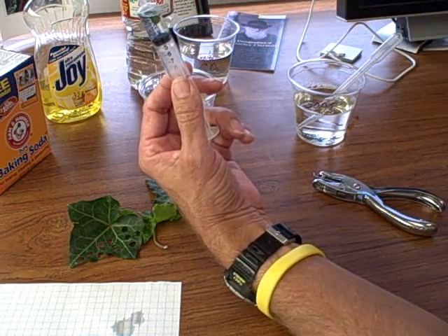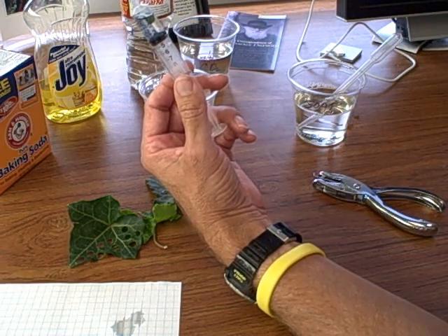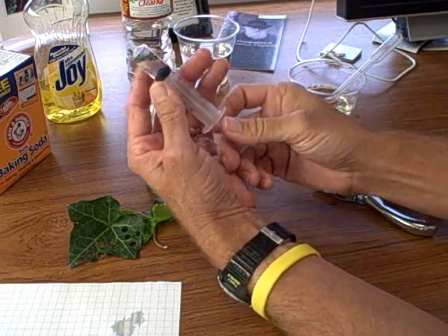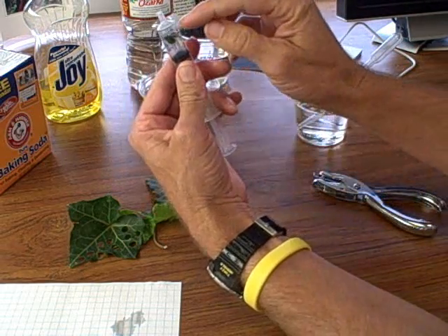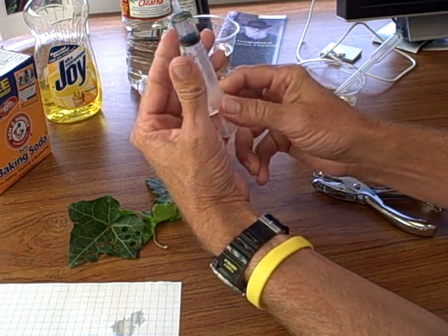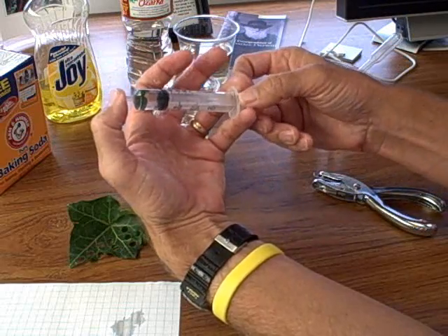Oops — I forgot to put the soap in there. Well, that's even better; let's see if they'll sink without the soap. Before I do, let's get rid of that bubble. I'm going to vertically orient this until I get just a little bit of water out of there.